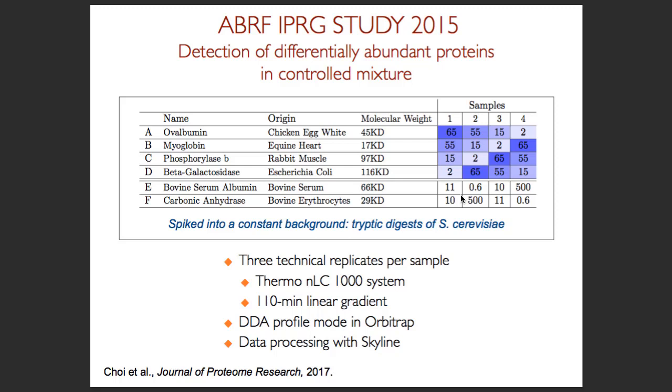And so what they do for that is they essentially have a series of studies where they share either biological samples or data sets, and then they use their current established practice to analyze the data, and then they compare results. So it's not a competition, it's more like, okay, what works best, how we can improve our workflows. And so myself and my group members were involved in one such study which focused specifically on statistical analysis of label-free LCMS. So we wanted to know specifically the data analysis side, how reproducible and how accurate the results were from various members of this community. And so to do that, we need to work in a situation where we know the answer, because it's really hard to compare the results if you don't know the ground truth.